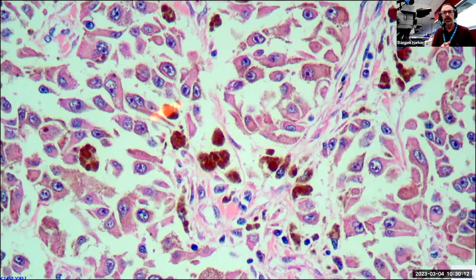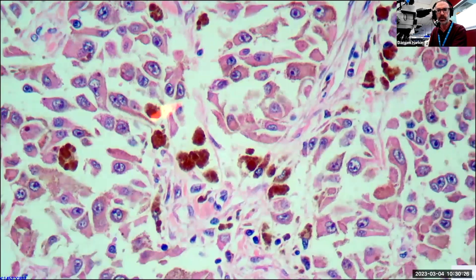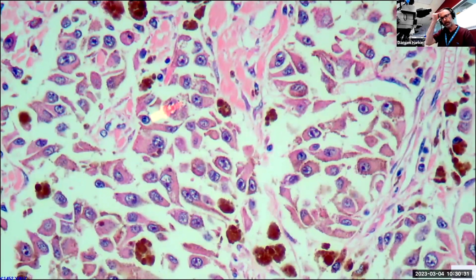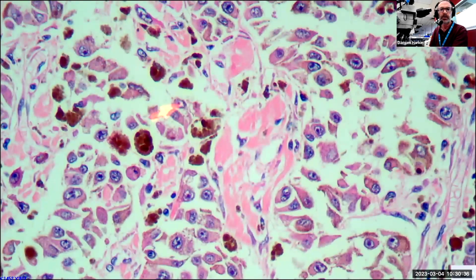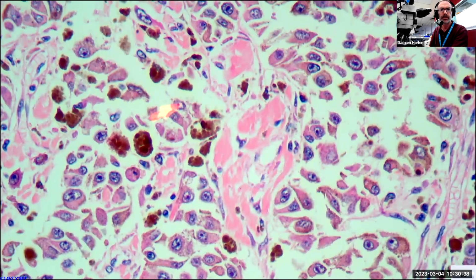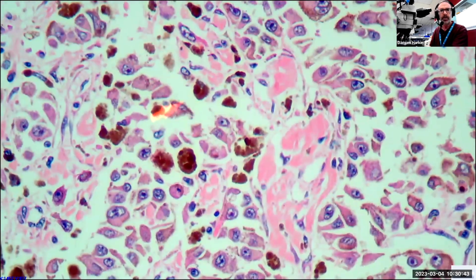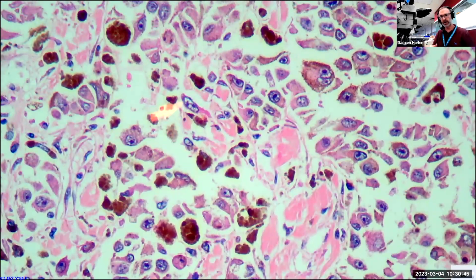Okay, would I be confident, therefore, in just assuming this is melanin? Well, no, it is best to do some type of test in order to be sure that we're actually looking at melanin pigment. So as I mentioned, there is a simple bleaching procedure using potassium permanganate followed by oxalic acid, both of which to some extent will oxidize the tissue.